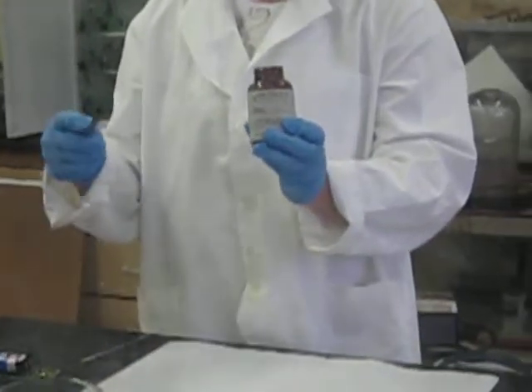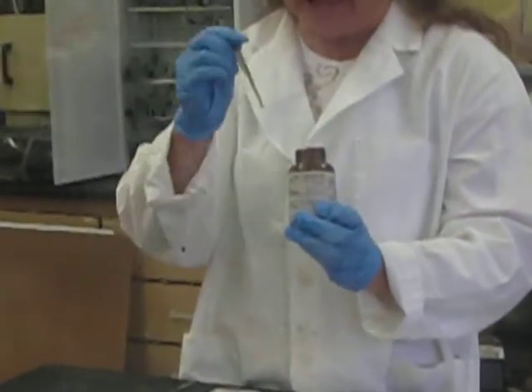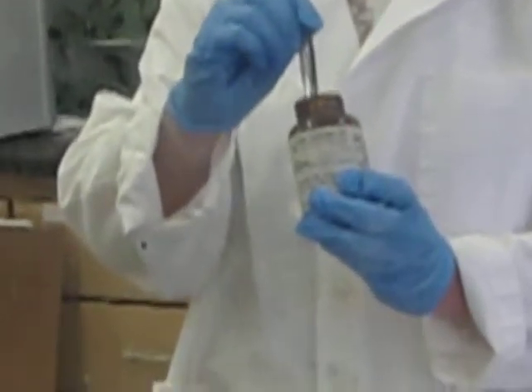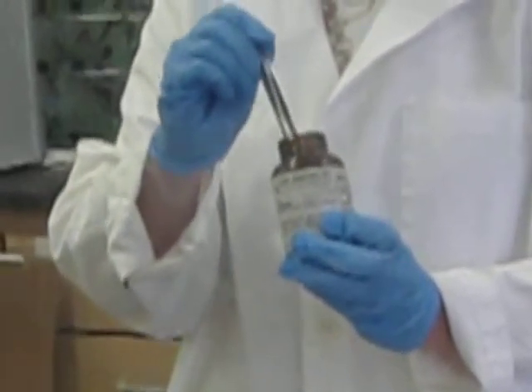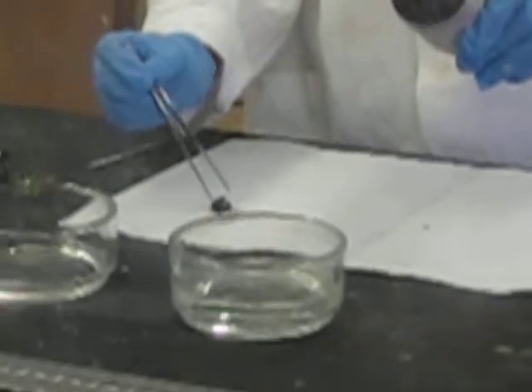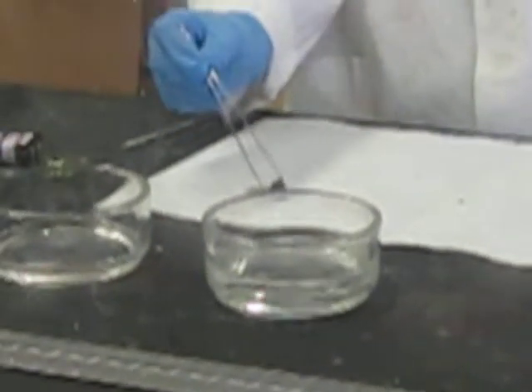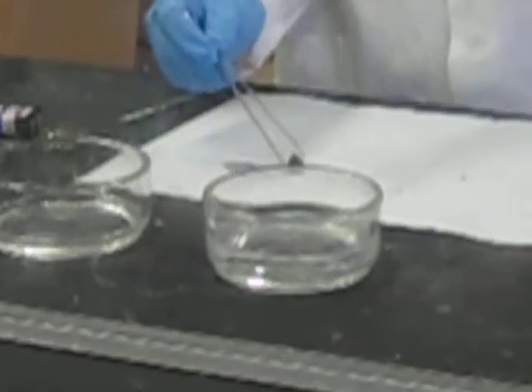Alrighty. So this is lithium. It is the element lithium, which means that it has the same number of electrons as it does protons. Yeah, this is serious. They store this in mineral oil. It's really goopy. And the mineral oil puts a coating on it that protects it from the air and from the water that might be in the air.